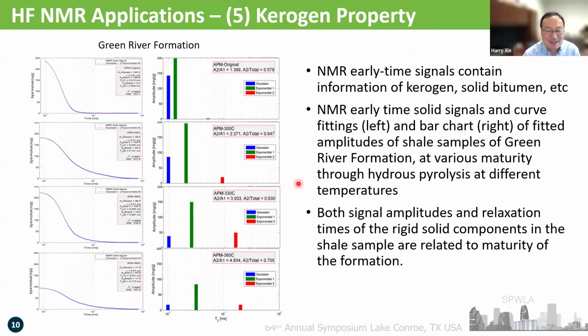Well, that's a very good question. That means you paid attention to it. Well, this is NMR basics. We don't use the so-called CPMG to do this data acquisition. Instead, we use the so-called solid echo. Solid echo is designed to capture early time data. I didn't have that diagram ready here.